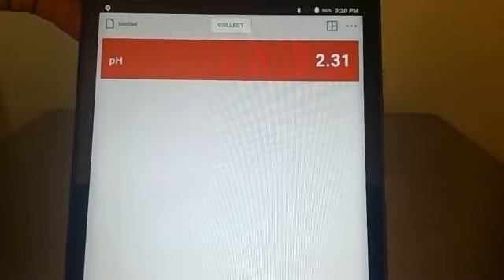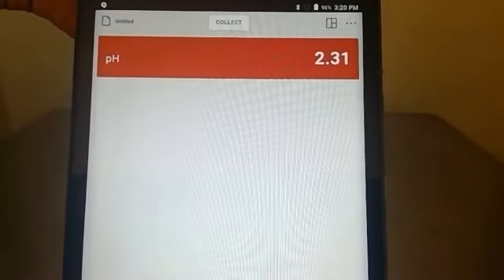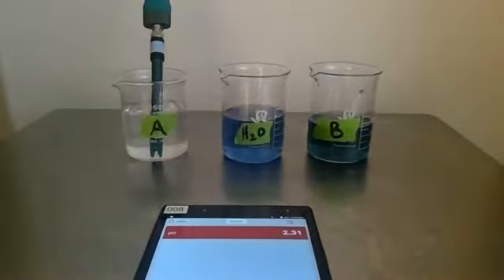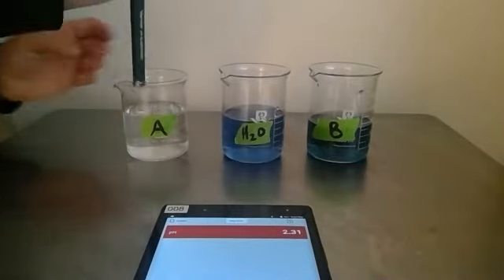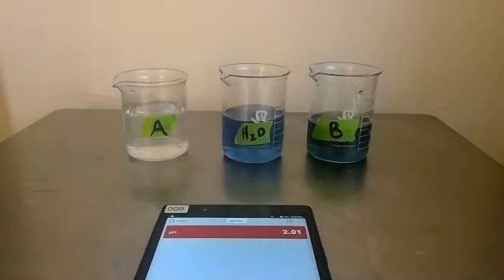Our dilute acetic acid, or vinegar, has a pH of 2.31. That's quite a bit different from our water at 6. That was a change of four for our pH to go from our water to our acid, versus what we saw was an increase of two between our water and our base. Now again, I'm going to add my indicator, which is that purple color.